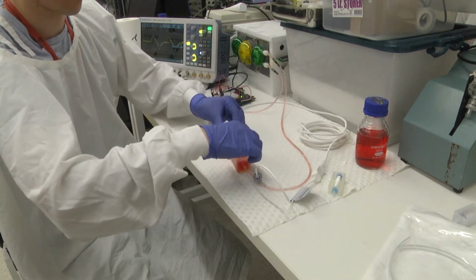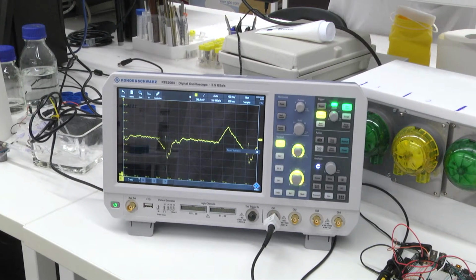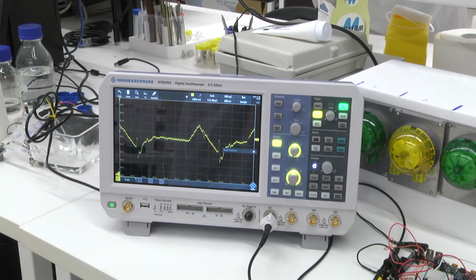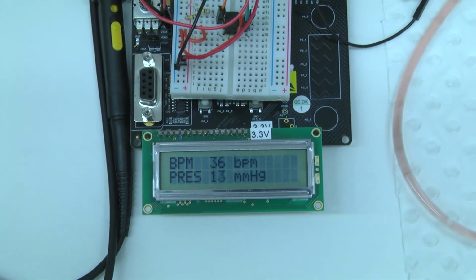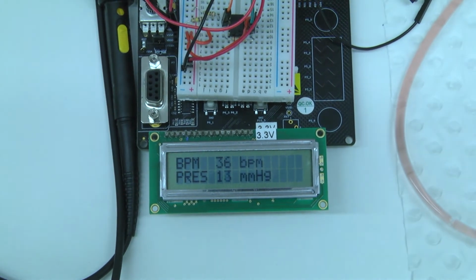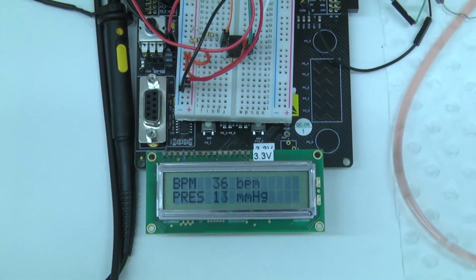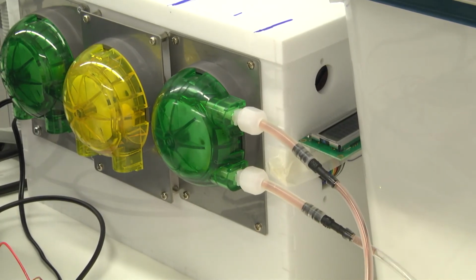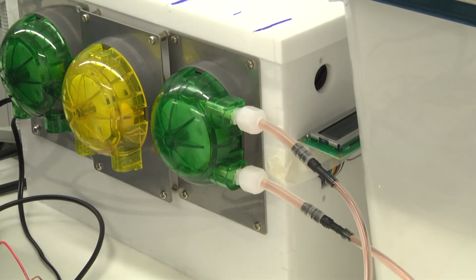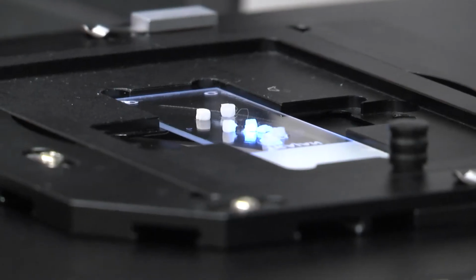So our bioreactor, as you can see, has some pulsatile flow to it, and in the supplementary video you can see it pulsing along with that flow. The good thing is we can culture it like that for several weeks, so 2-3 weeks is within the scope of what we've done so far. And then we can look inside the grafts, work with microscopy or histology, and see how the cells behave.